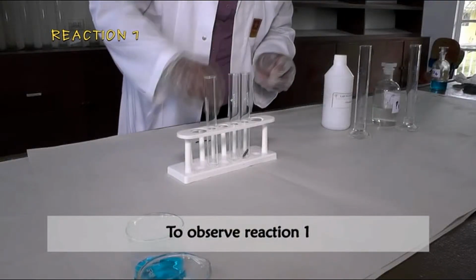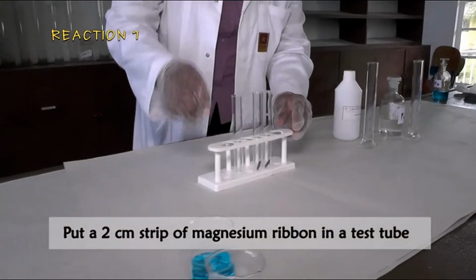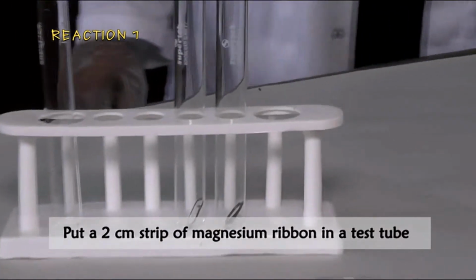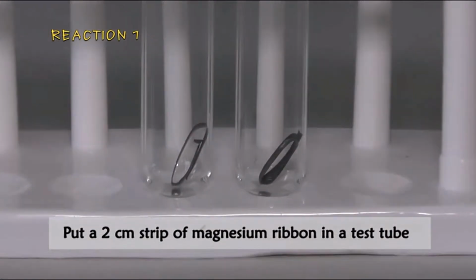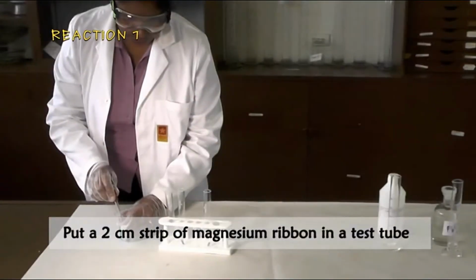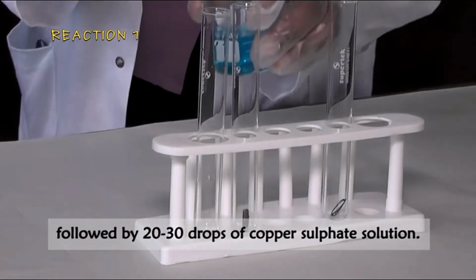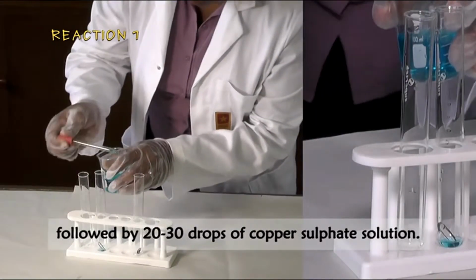Method to observe reaction 1. Put a 2 cm strip of magnesium ribbon, followed by 20 to 30 drops of copper sulfate solution.